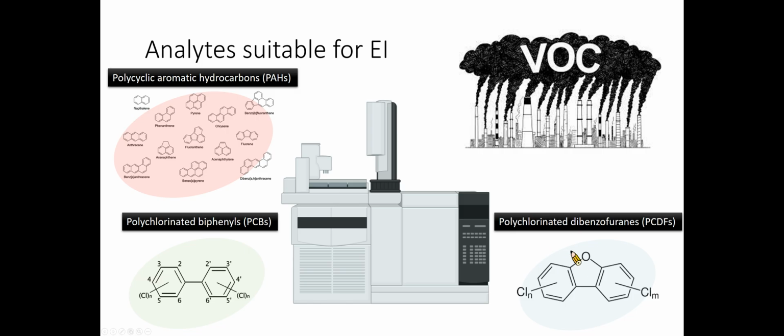The analyte should be able to evaporate or sublime without significant thermal decomposition. For example, saturated and unsaturated aliphatic and aromatic hydrocarbons and their derivatives such as halides, ethers, acids, esters, amines.